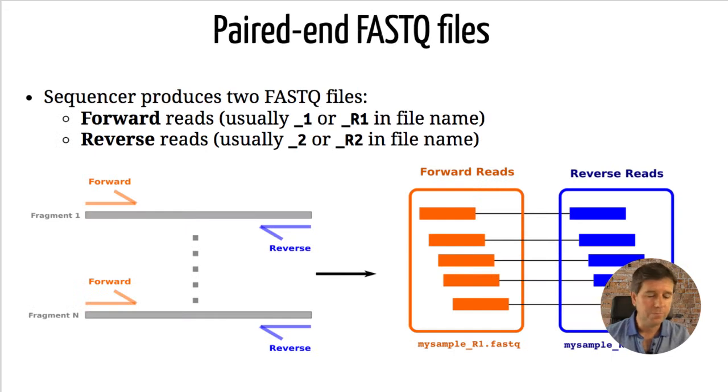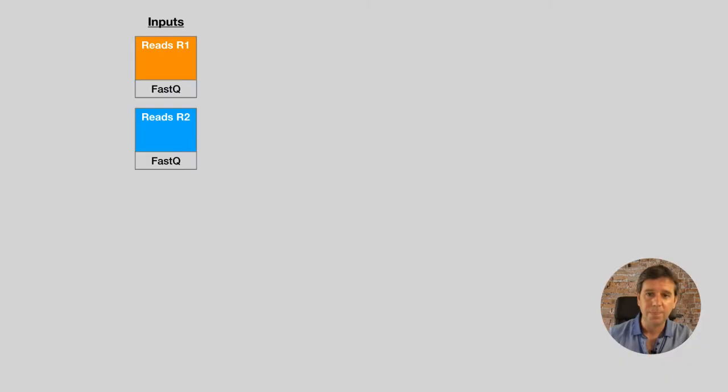So what we're going to do is we have two files. Of course, this is paired end sequencing, so we've got a forward read and a reverse read. Most data you'll see these days is paired end. The cost advantage you used to have from doing single end sequencing is not really a driving factor anymore. So most folks will do paired end sequencing like this, where we have a forward and a reverse read, these pairs here.